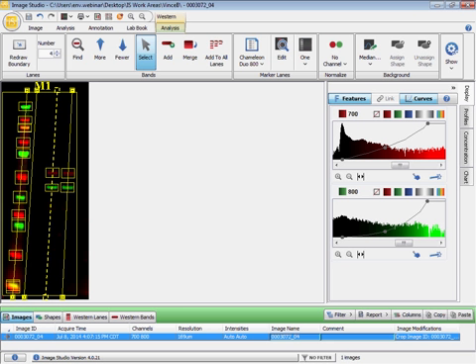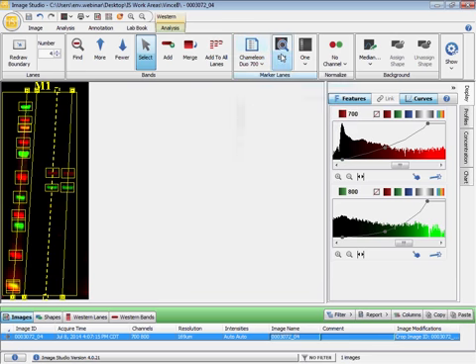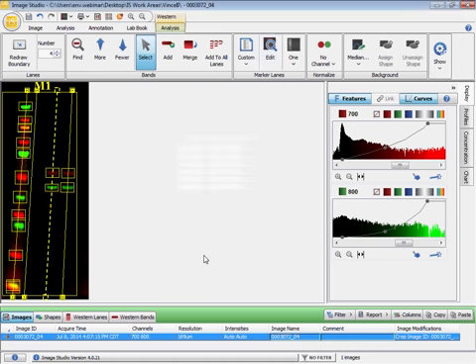And again, let's repeat the process for the Chameleon 700 ladder. The Chameleon 700 ladder is very similar to the Chameleon Duo 700, so let's start by selecting the Chameleon Duo 700 and we'll edit that. And the only difference between the two is that the Chameleon 700 does not contain the 125 band value. So we'll click on 125 and remove, and then click OK to confirm.